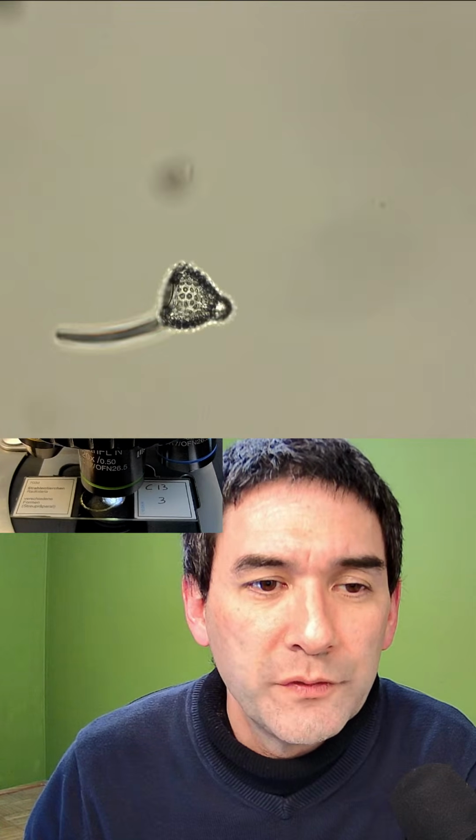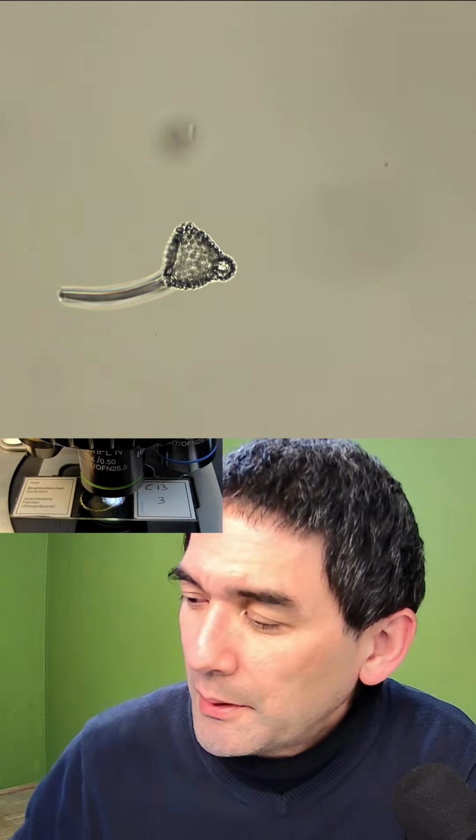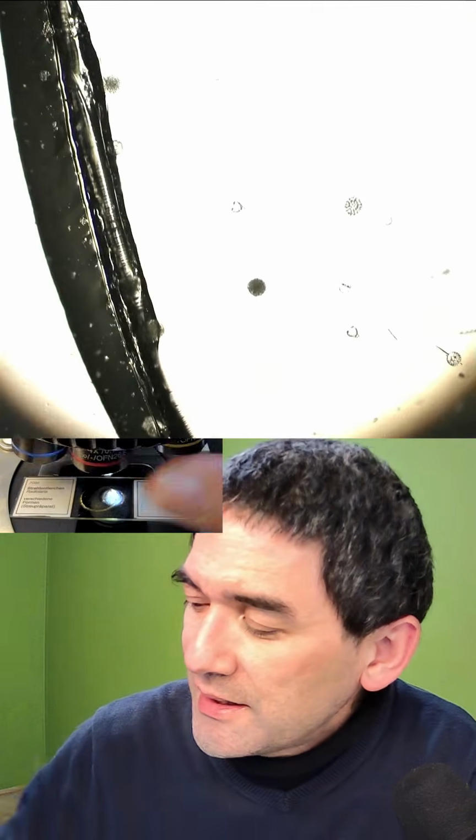There are a whole bunch of different shapes. They might be a little bit small, but they're quite nice to be seen in dark field too. You can see them quite well. Unfortunately, I only have dark field with my low power.